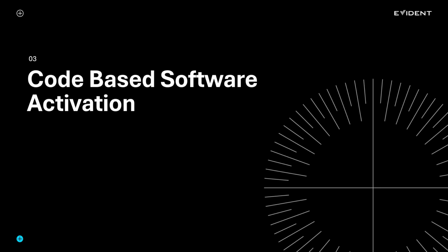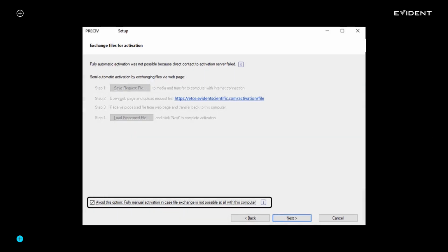In rare occasions, we will come across a computer that we need to put a license on that not only is offline, but the company or institution's policy prohibits USB devices being plugged in, so we can't even do an activation by file exchange. In these cases, you can have the software activated by code. I can't really show you a demonstration on this, so I'm going to show you a couple of screenshots from the installation manual. Because I'm using an Evident demonstrator license, the fully manual activation option was missing from my Exchange Files for Activation dialog window.